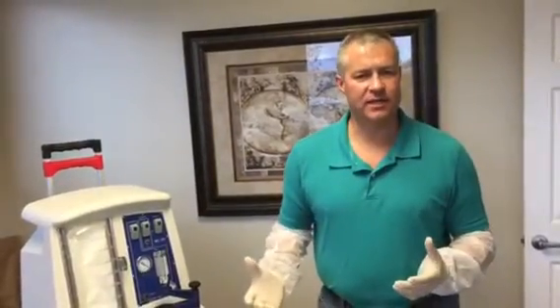Hi, this is Jared. I'm with MVAC Systems. I wanted to make a quick video to show everybody really how simple the MVAC is.